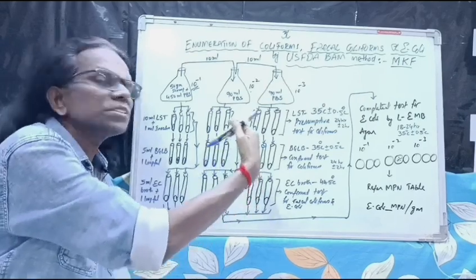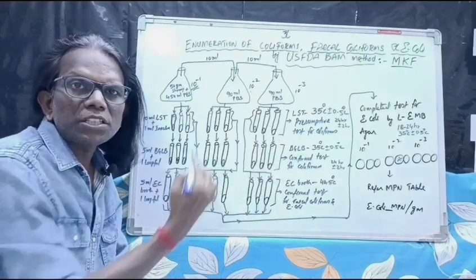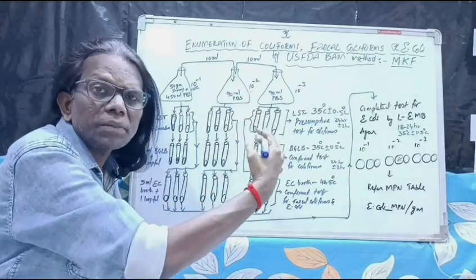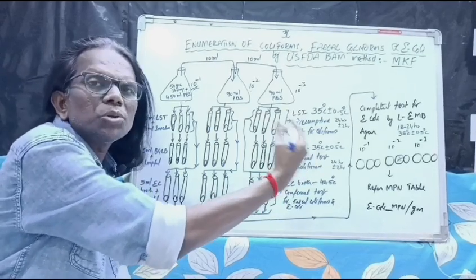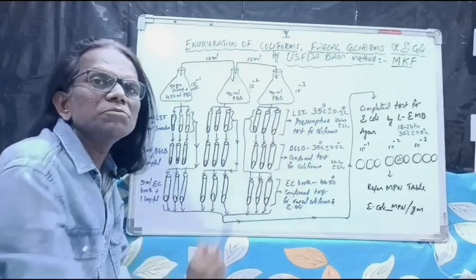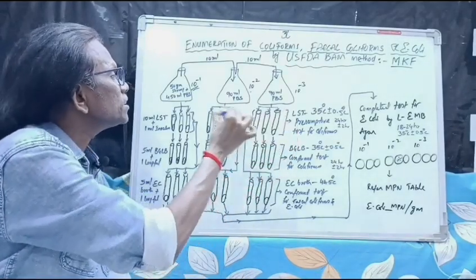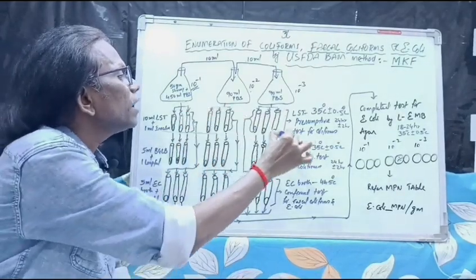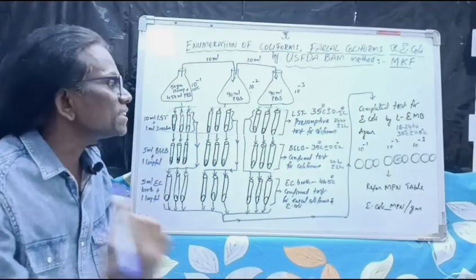If no gas formation occurs in some tubes, re-incubation may be required. So we have to re-incubate for 24 hours plus or minus 2 hours and observe at 48 hours. If still no gas formation occurs, then discard the tubes. This is the presumptive identification test using LST, lauryl tryptose broth, which contains lactose.